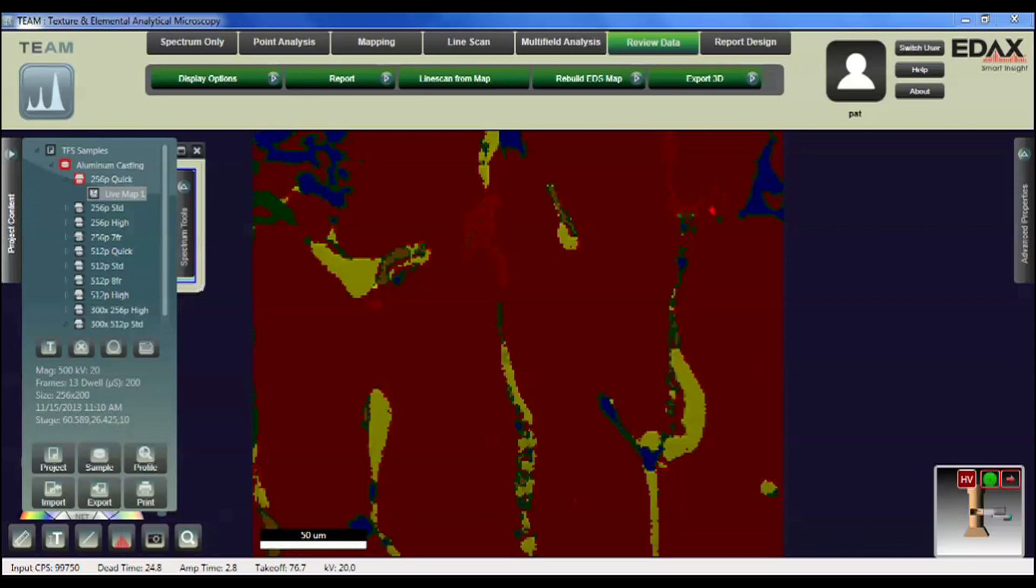The first step in the analysis is to start the Team software, log in, and open a project as normal, as long as the project has a map file that can be loaded.